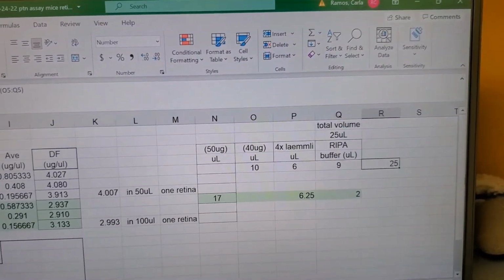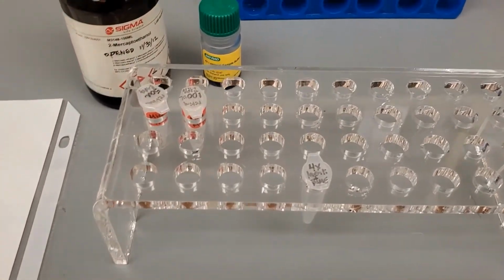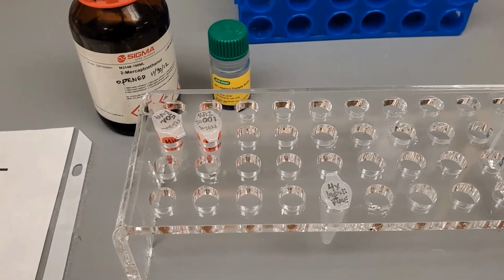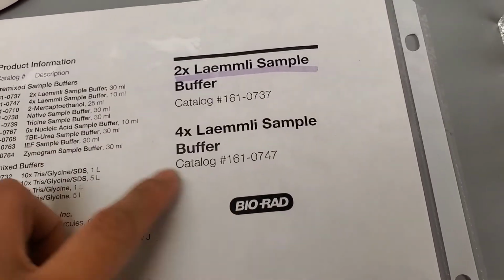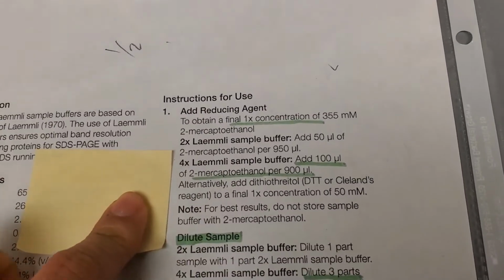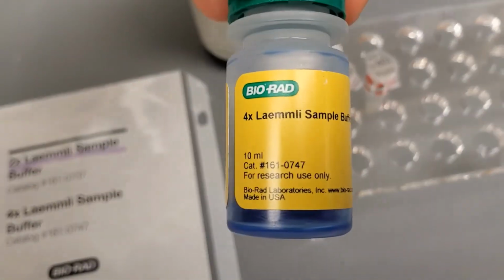Okay, there we go. In this step, I'm going to be preparing my cell lysate samples. We're going to denature them in order to run them in the SDS-PAGE gel. For that, I use the Bio-Rad 4x Laemmli sample buffer. When you look at the protocol, it is very important that you have the protocol for the 4x and not the 2x. You need to make sure that you have the appropriate Laemmli buffer.